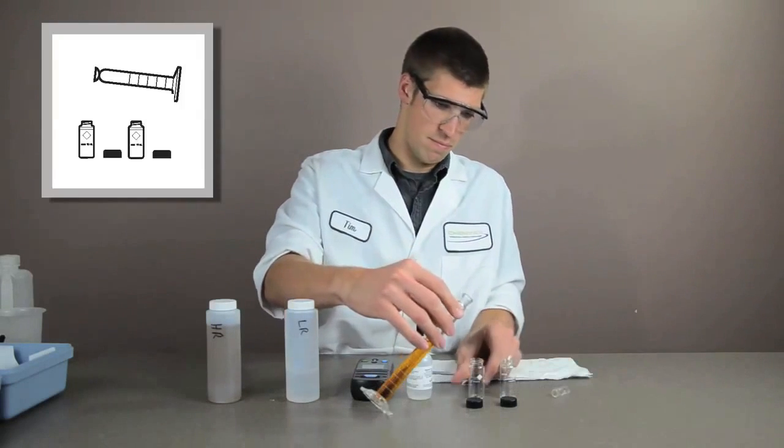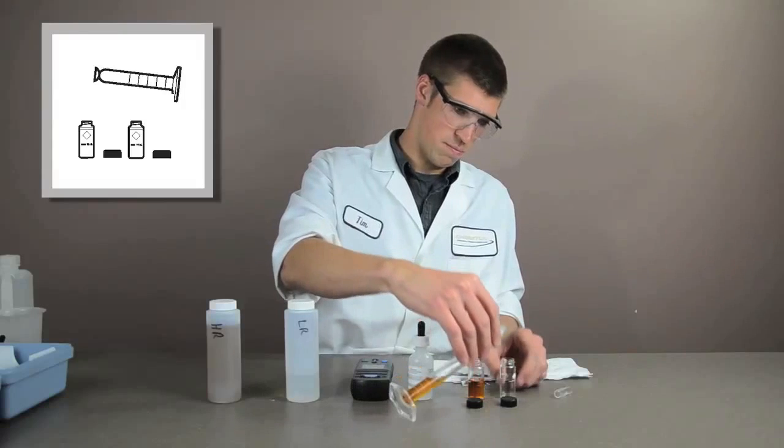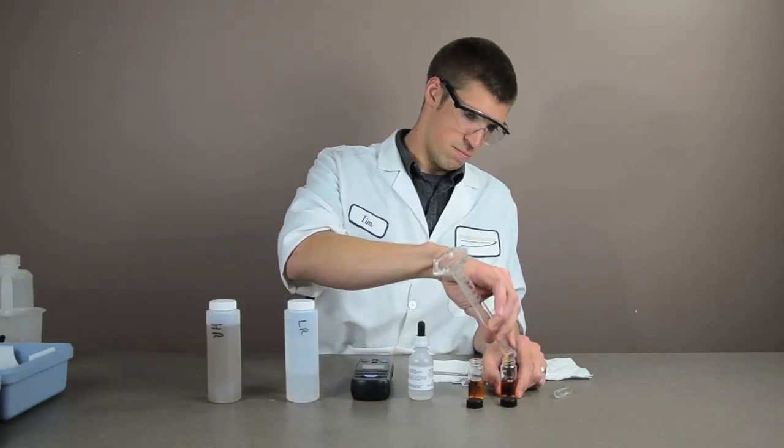Split the sample by filling two 10 milliliter sample cells to the 10 milliliter mark. Cap one of the cells. This is the blank.